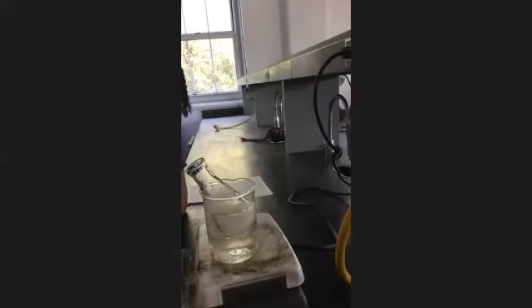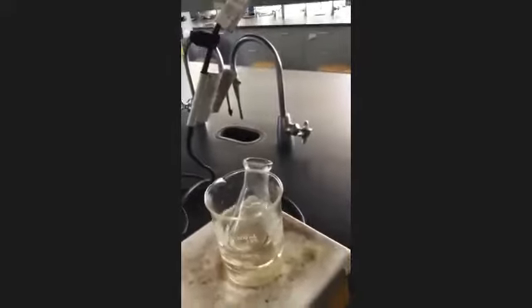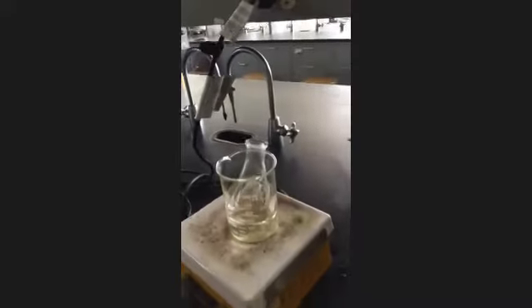It's about to boil now. So once it starts boiling, it'll go in the solution. You should be good. You clear over there almost? Not yet. Is it going in? Let me get a different one right quick. So for Amari, you can see here that his is going all the way clear, right? So you can see all the acetic anhydride and salicylic acid has reacted. So it's all the way clear. Once it goes clear, you just let it keep heating for another 5 minutes and it's good.